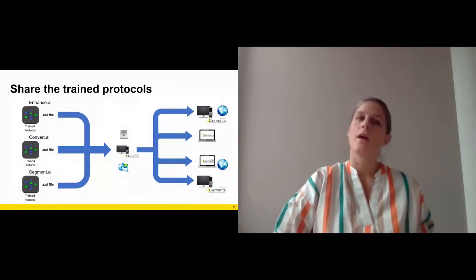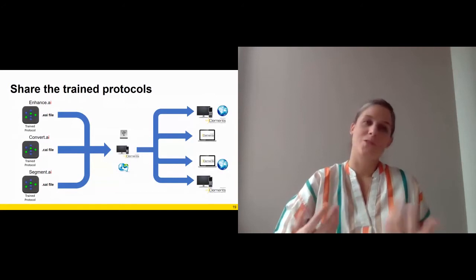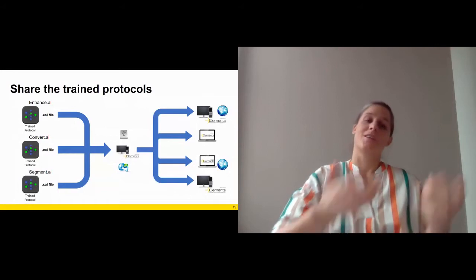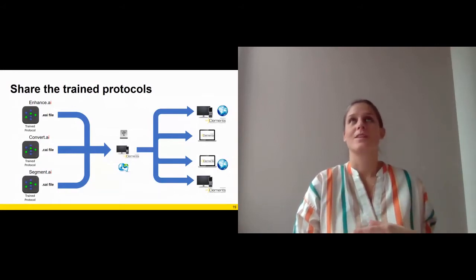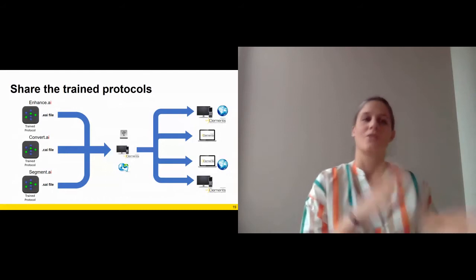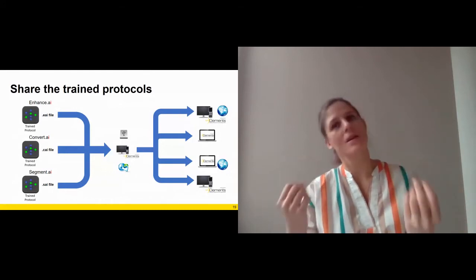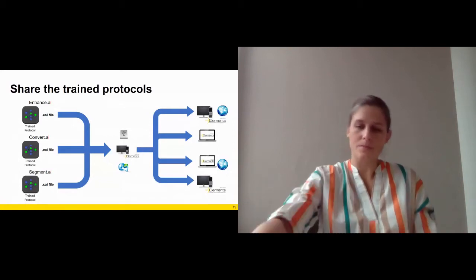As well there, make sure that when a new feature suddenly appears, or maybe over years your sample changed, you have to go back to the training. So as well there, if you give somebody, to make it easy, an algorithm which identifies cats, it should not be used on dogs, right? So this is the only thing you have to keep in mind. So always be aware of what you put into this algorithm.